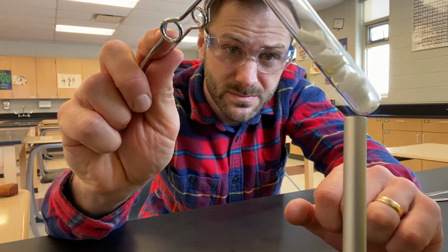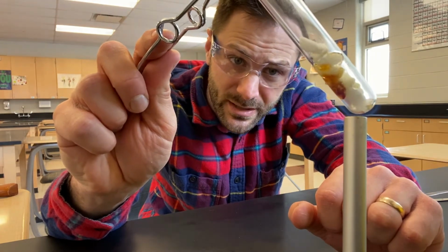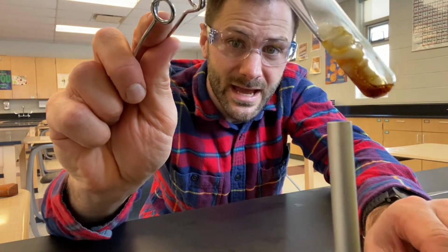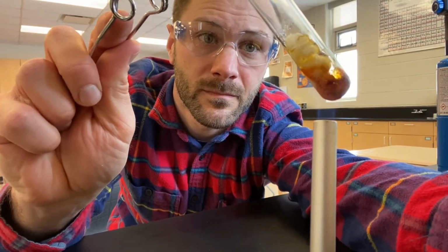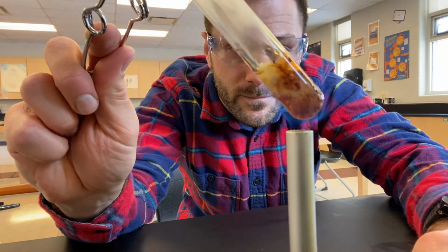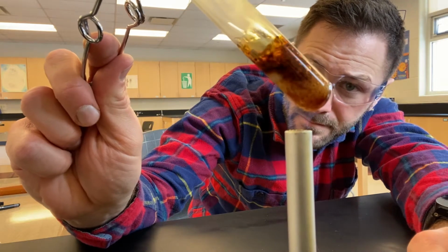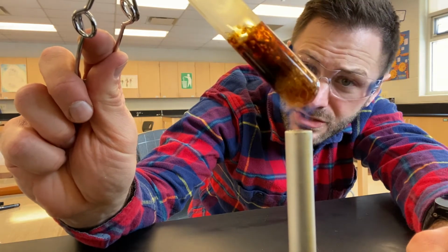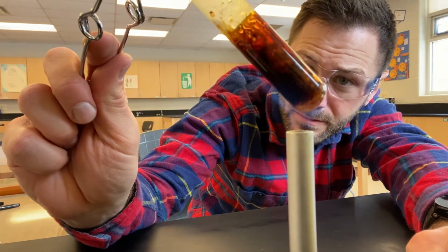Don't worry, the test tube is made of borosilicate glass. It's the same stuff you might make Pyrex out of, so it is capable of getting very, very hot and doing it safely. Now, watch what's happening to the sugar. You can see we've got a color change going on. It was white, then started to turn light brown. It was solid, and it's turning to a liquid. That light brown is becoming a much, much darker brown.